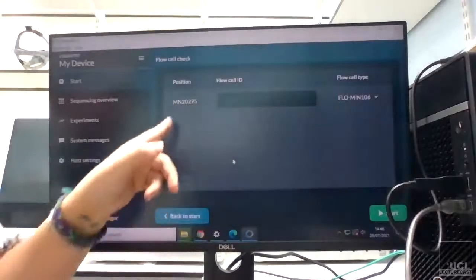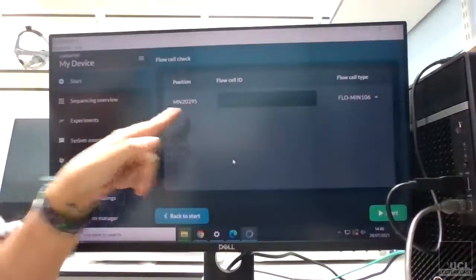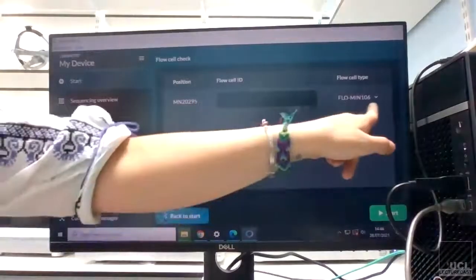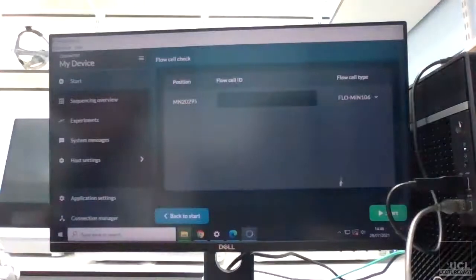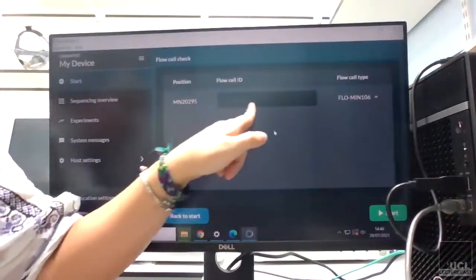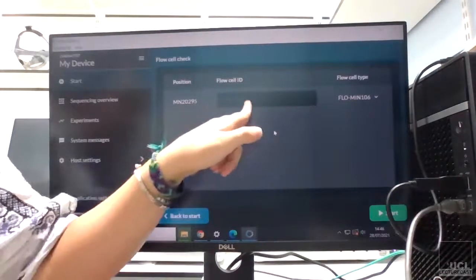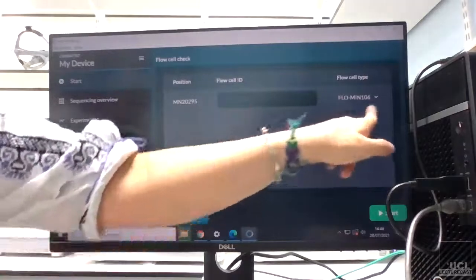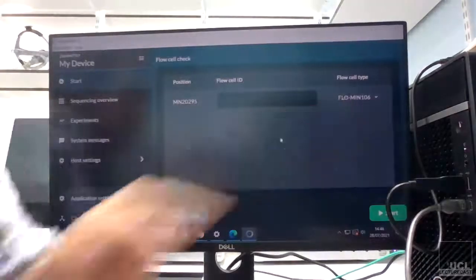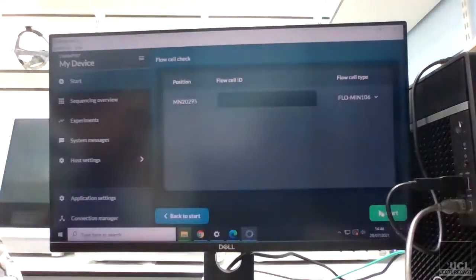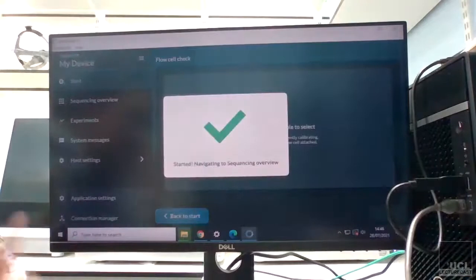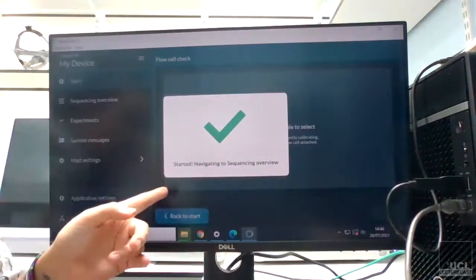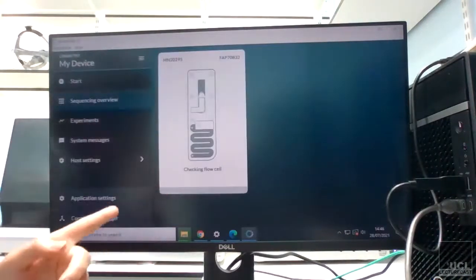And this brings up the MinION and also the flow cell that I've got in the MinION. So that's the flow cell ID there, so that's the number on the flow cell and that's the type of flow cell. And if I just go down to Start, it should hopefully do that and then say navigating back.